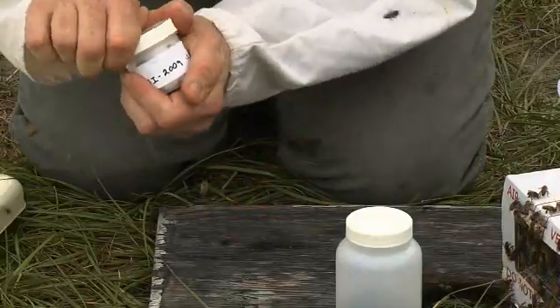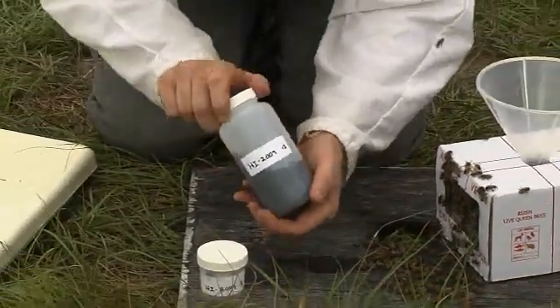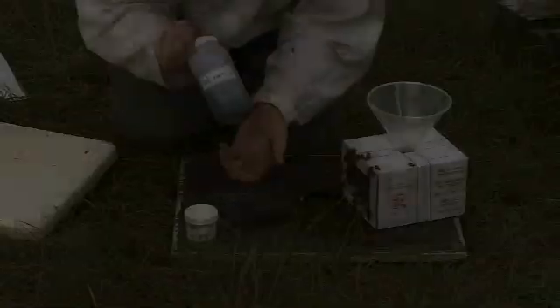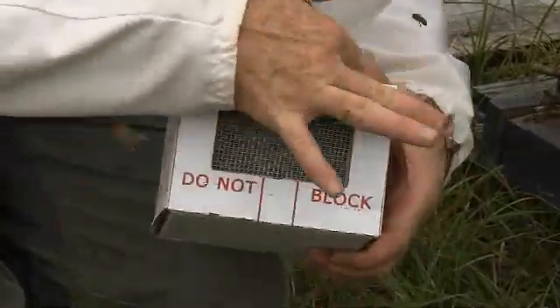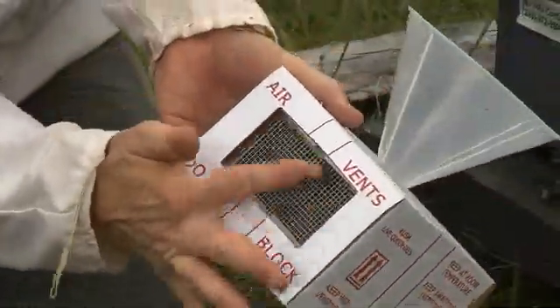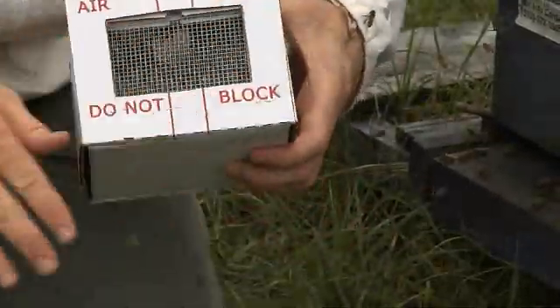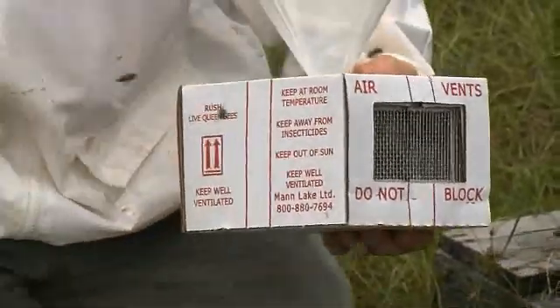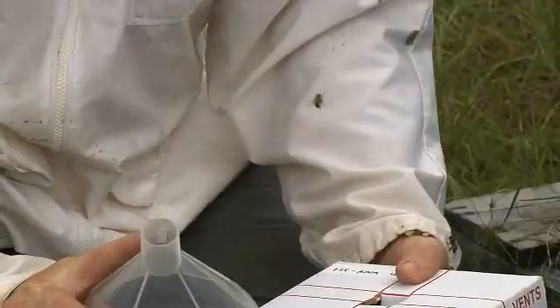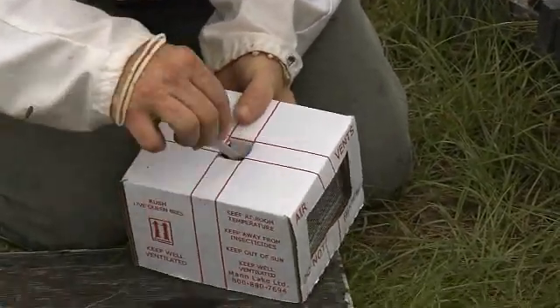Double-check to be sure that the lids of the small and large collection bottles are tight so they do not leak during shipping. Gently brush away any live bees that may cling to the box. Check all seams of the box to be sure they are flush and that no bees are present — the postal service will reject any shipment that has live bees exposed. Remove the funnel from the live bee shipping container and lift the flap so it is flush with the top.